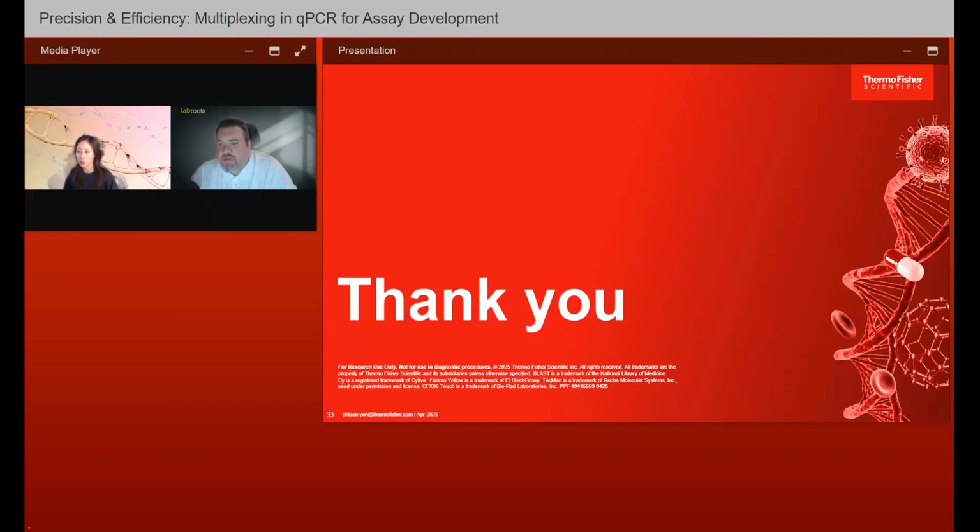What is the purpose of passive dye, and is ROX a passive dye? Oh, yes, I apologize for not explaining that. ROX is actually a passive reference dye. That dye comes up in the JUN channel typically, and a passive reference is a good thing to have to control for the variability in pipetting between different wells.